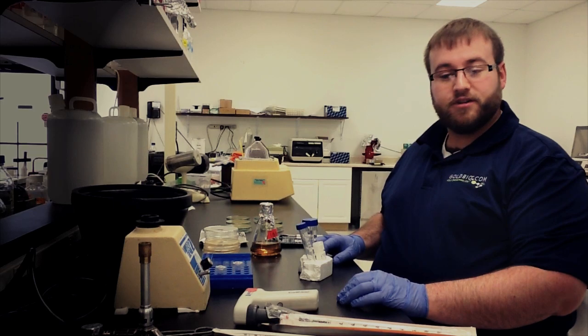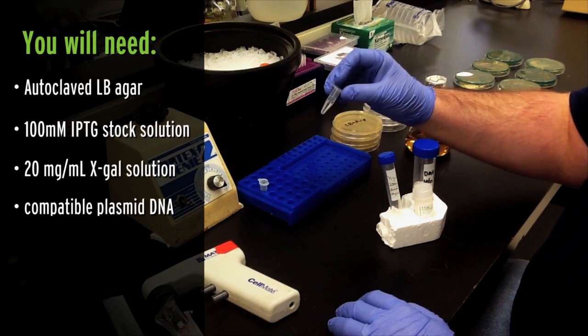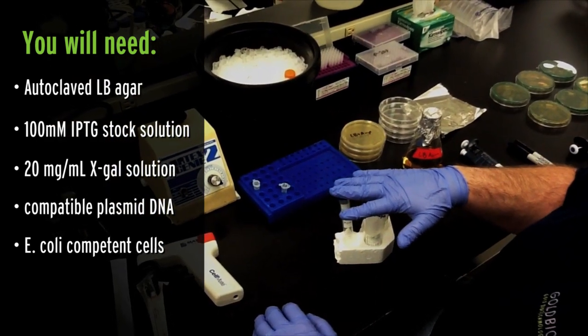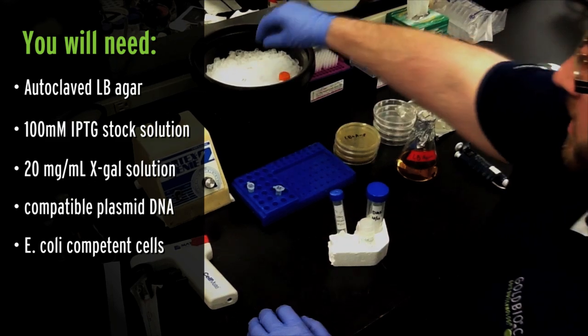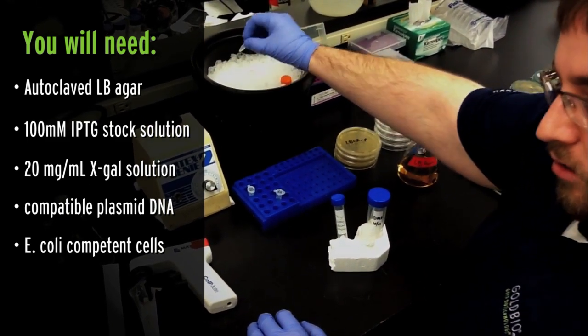To get started, you'll need the following: autoclaved LB agar, 100 millimolar IPTG stock solution, a 20 milligram per milliliter X-Gal stock solution, a compatible plasmid vector with cloned DNA, and E. coli competent cells.